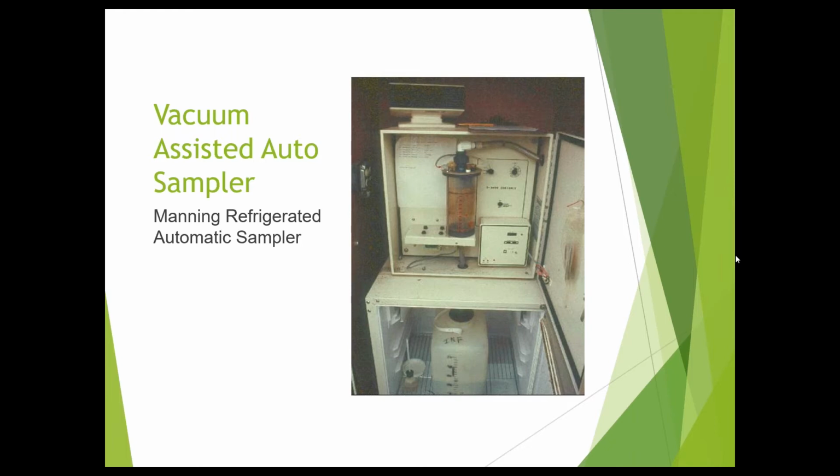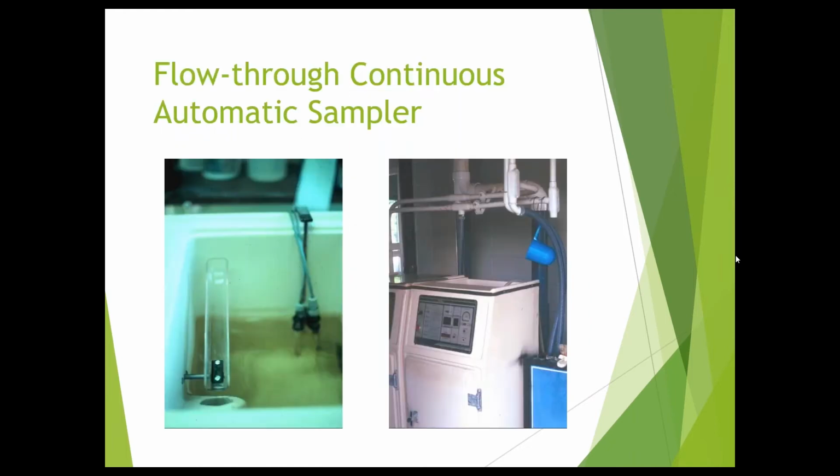So it's less than 40 mils. That's where it likes to live. And then here, this is a continuous sampler. So it's basically a floor model. It's refrigerated like the ones we've been seeing previously.